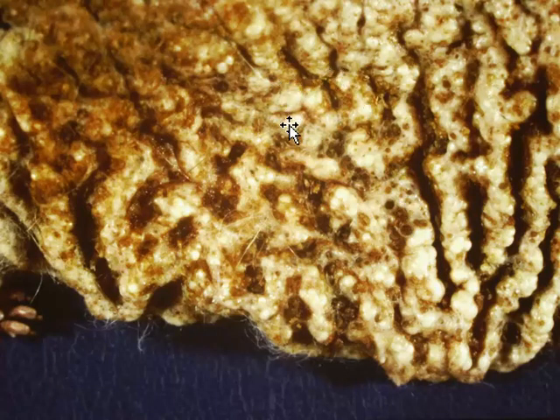And just a slightly closer look at this animal, just the presence of these large keratin-filled comedones results in overall thickening of the skin. You can see some of these individually on the surface of the affected animal. Notice that this is a hairless mouse, but it's not truly hairless.